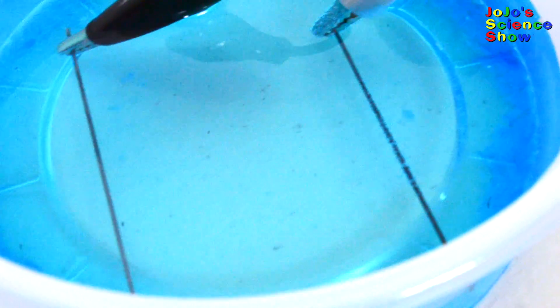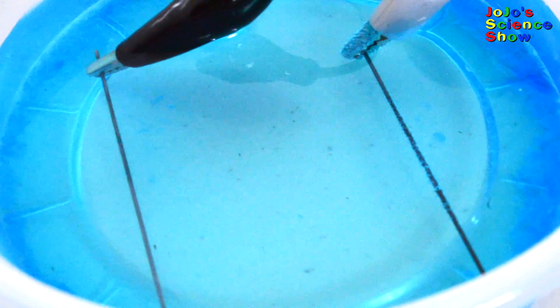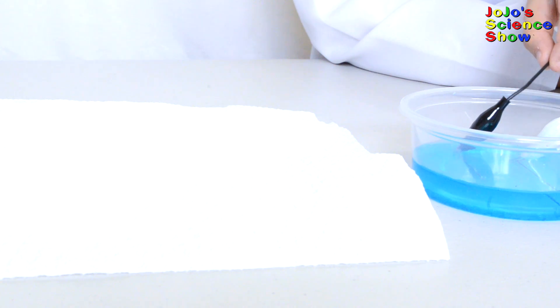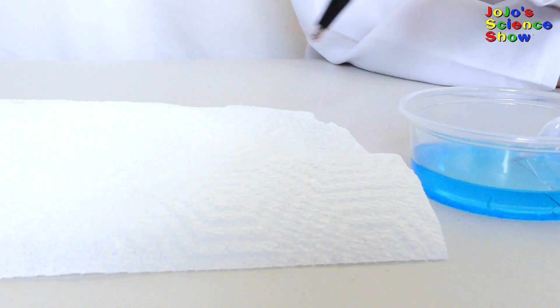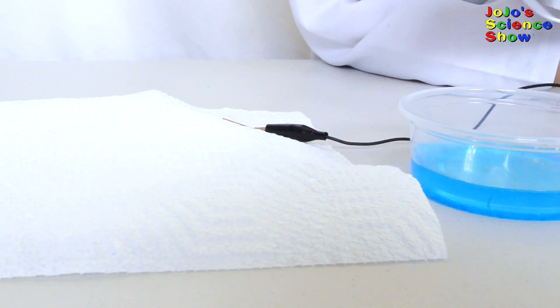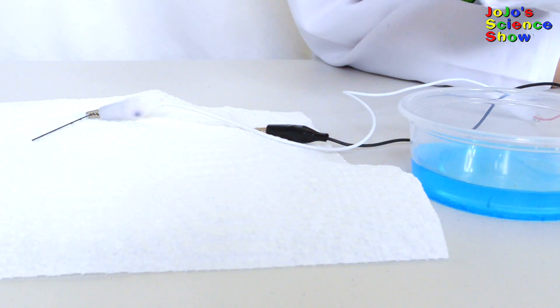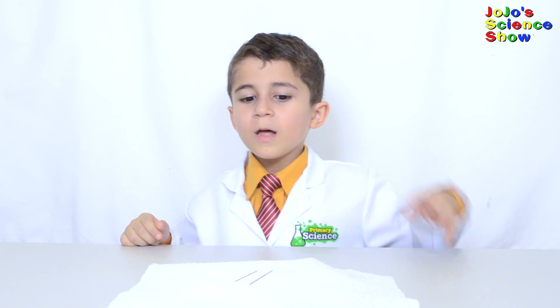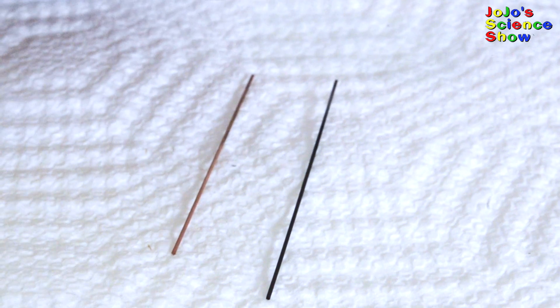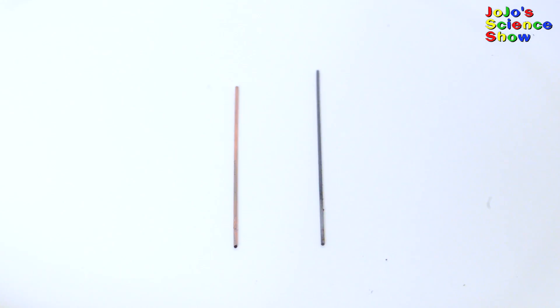Do you see how copper metal is forming on one electrode and bubbles are forming on the other? Why is that happening? Isn't that awesome? Look! See how one pencil lead is coated in copper and the other one isn't?